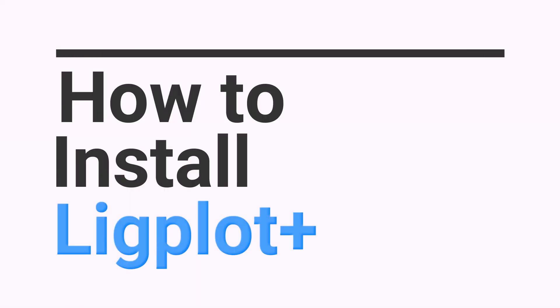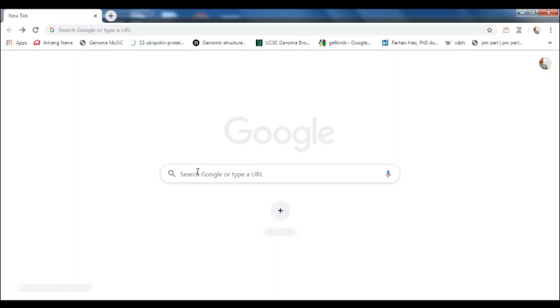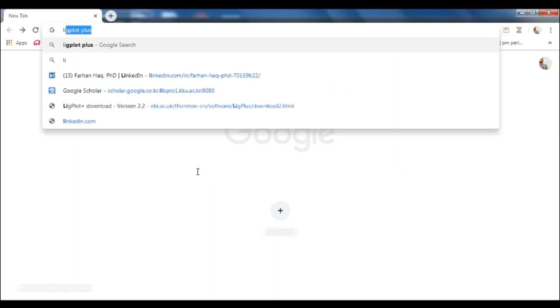As-salamu alaykum everyone. In this tutorial we will talk about how to install LigPlot Plus in your Windows operating system. This is a picture which you want to take from LigPlot — these are different interactions between two protein structures.